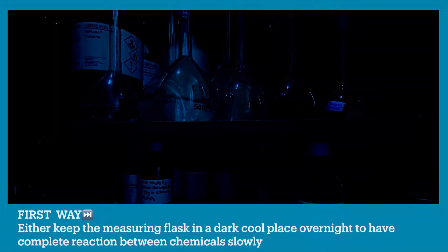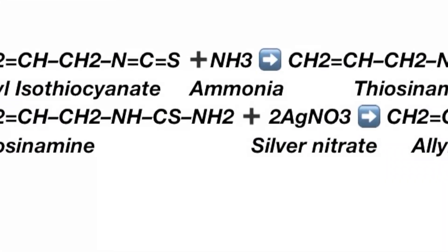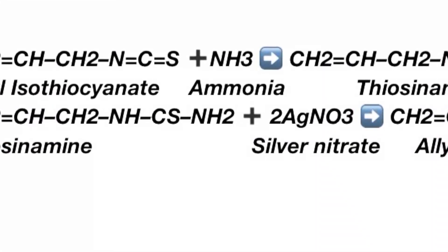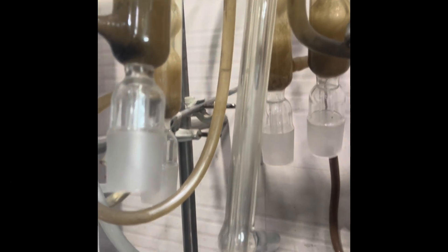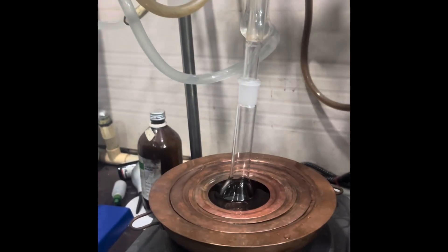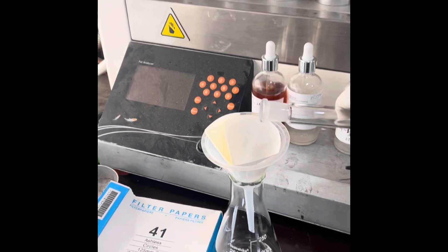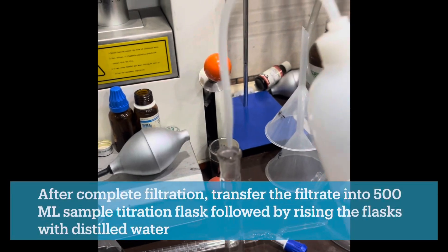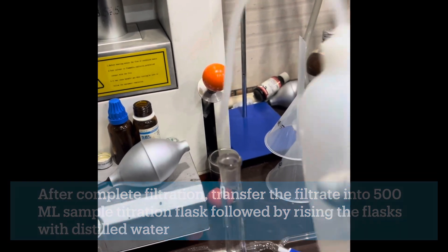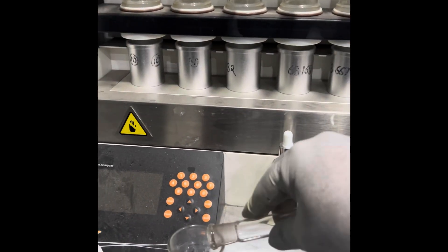After this you have two options: either keep the receiving flask in a dark cool place overnight to allow complete reaction between the chemicals, or heat the distillate mixture on a water bath for half an hour by attaching a reflux air condenser to the receiving flask. After this, filter the distillate into a conical flask using a funnel and filter paper. After complete filtration, transfer the filtrate into a sample titration flask by rinsing the receiving flask with distilled water.